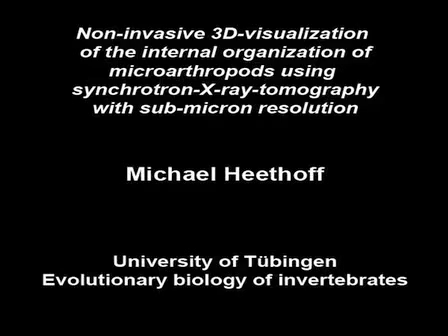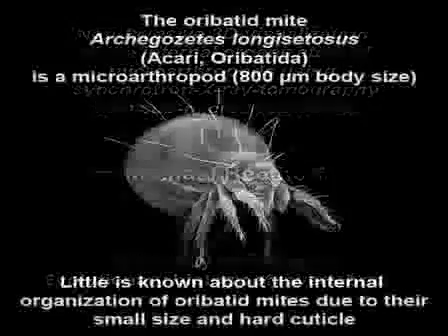Hello, my name is Heethoff from the BATS lab at the University of Tübingen, and in this presentation I want to talk about non-invasive three-dimensional visualization of the internal organization of micro-arthropods using synchrotron X-ray tomography with a sub-micron resolution.